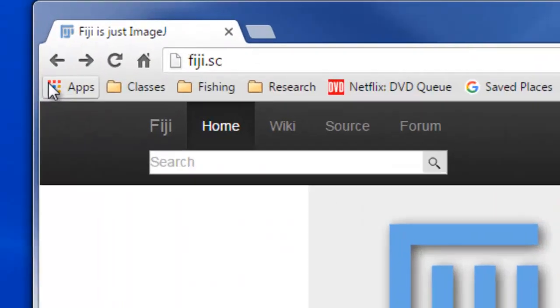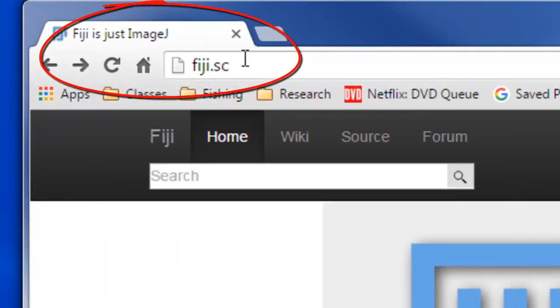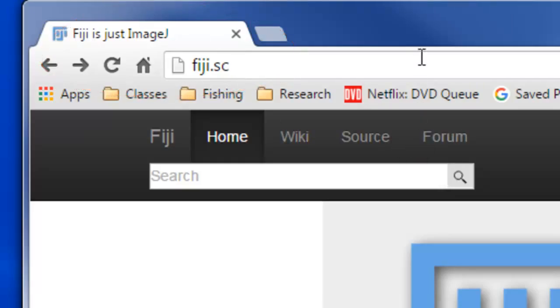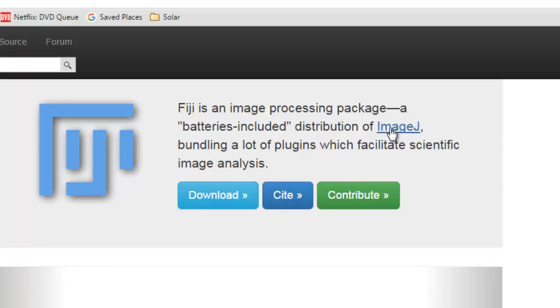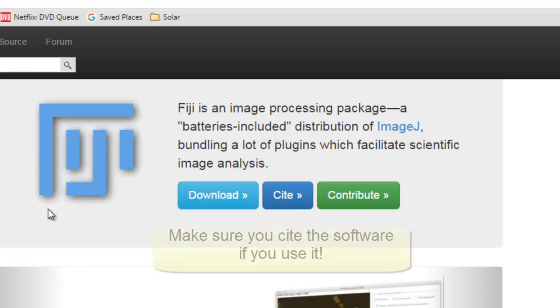I want to quickly show you how to use the software to measure the size of bacterial or mold colonies. The program we're going to use is called Fiji, at fiji.sc — it's another name for a program called ImageJ. This is open source software, anybody can use it, it doesn't cost anything, it's very powerful, and that's why we use it. If you use it, you have to make sure you cite it.